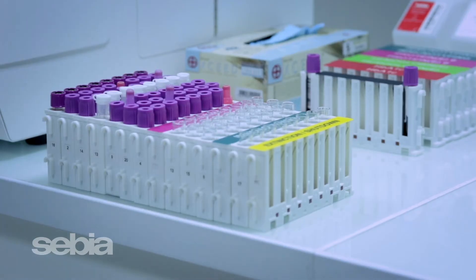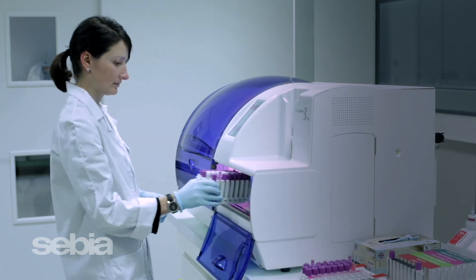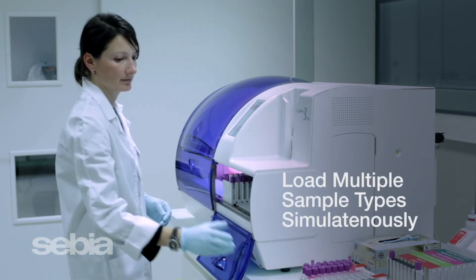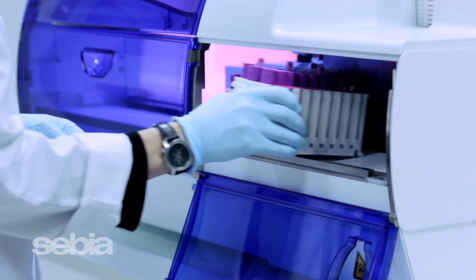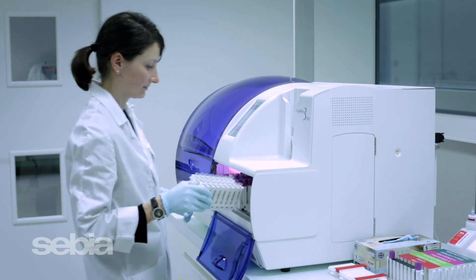When you are ready to process your samples, simply load your racks of primary tubes onto the instrument's inlet bay. Different sample types can be loaded at the same time for maximum walk-away capabilities. RFID assay racks are used to alert the system to switch testing modes.